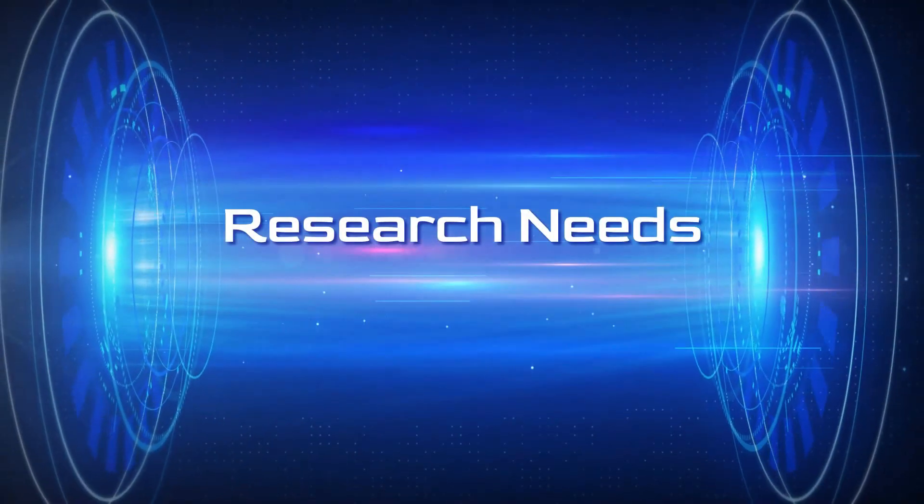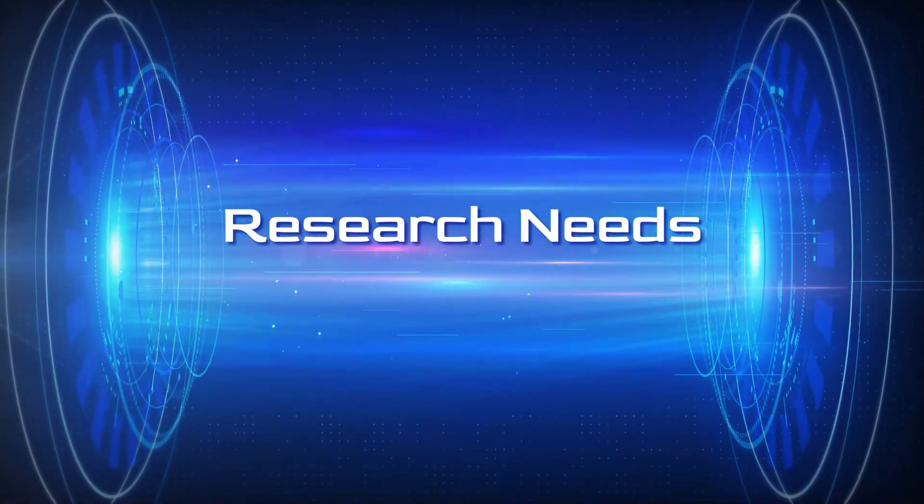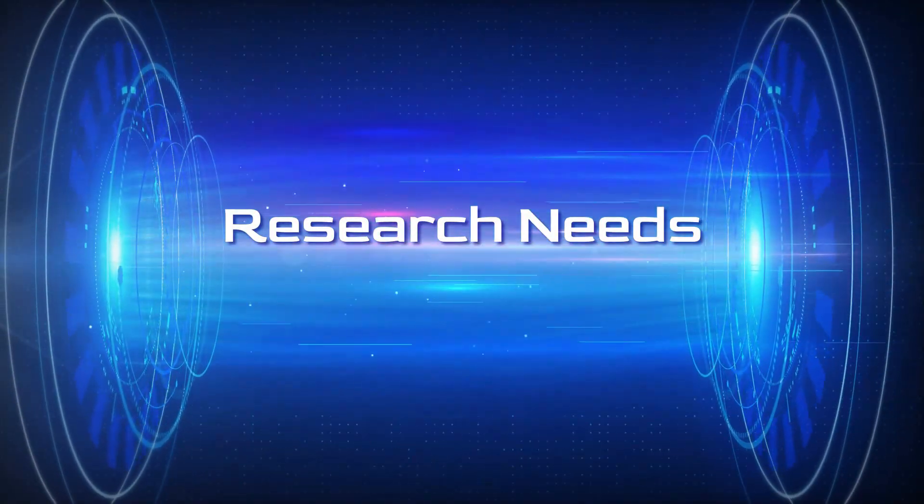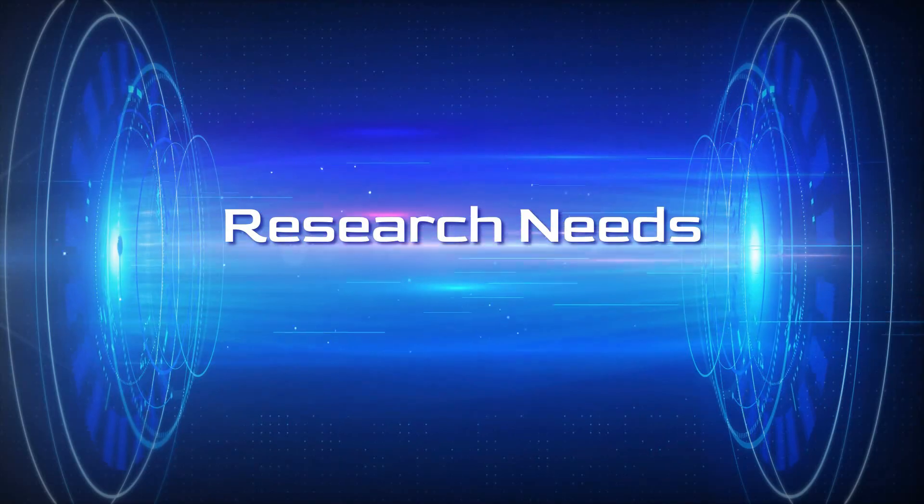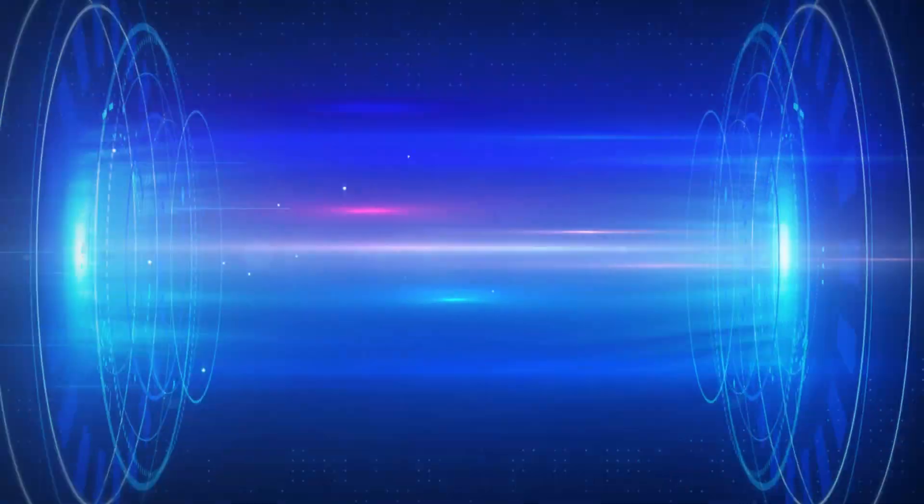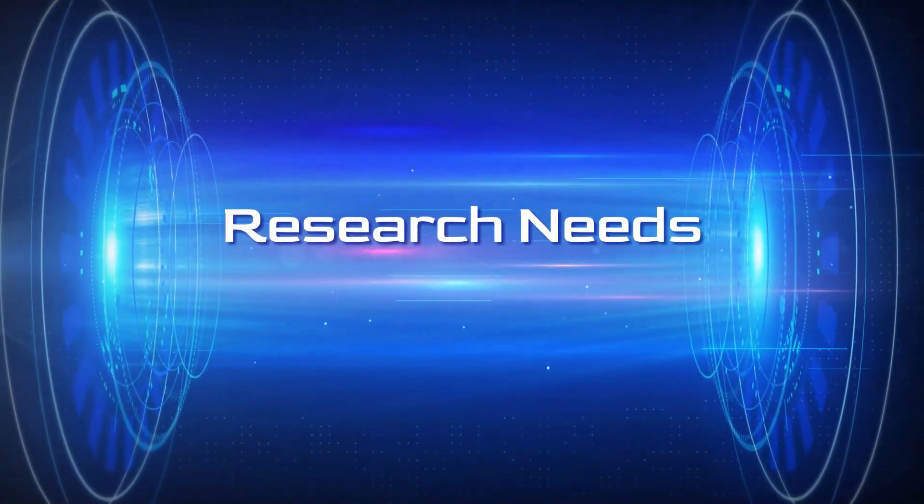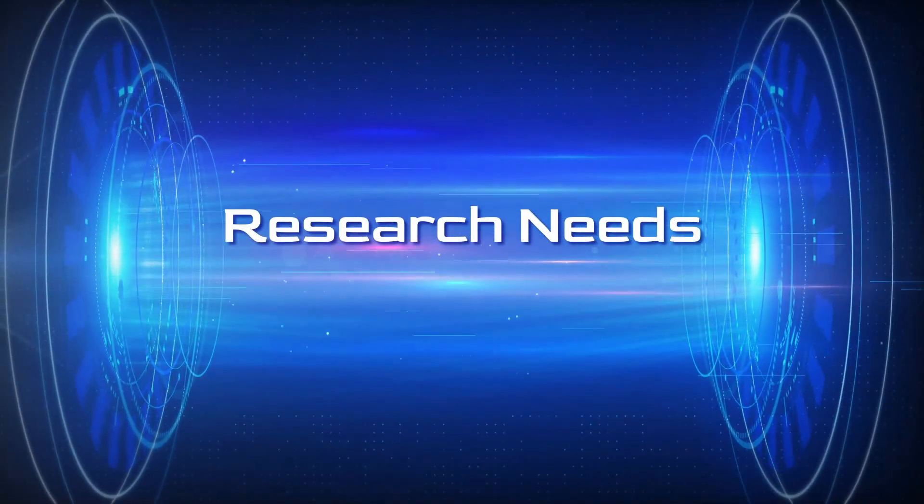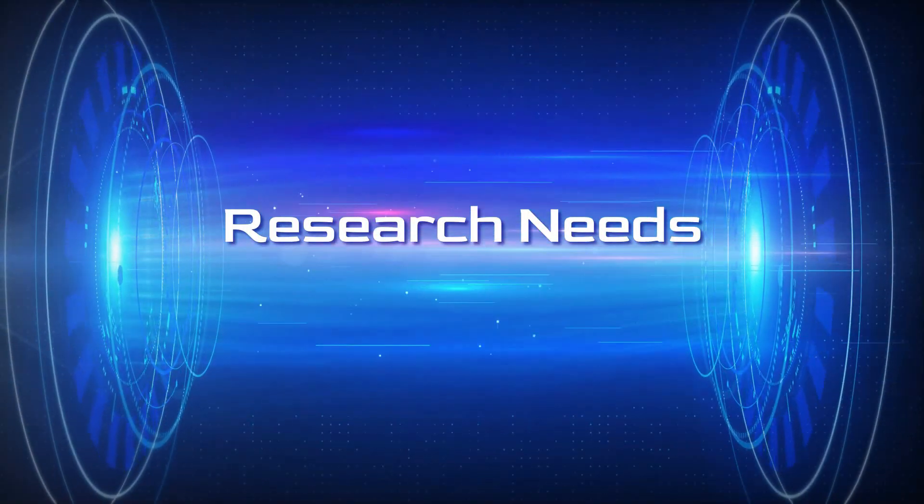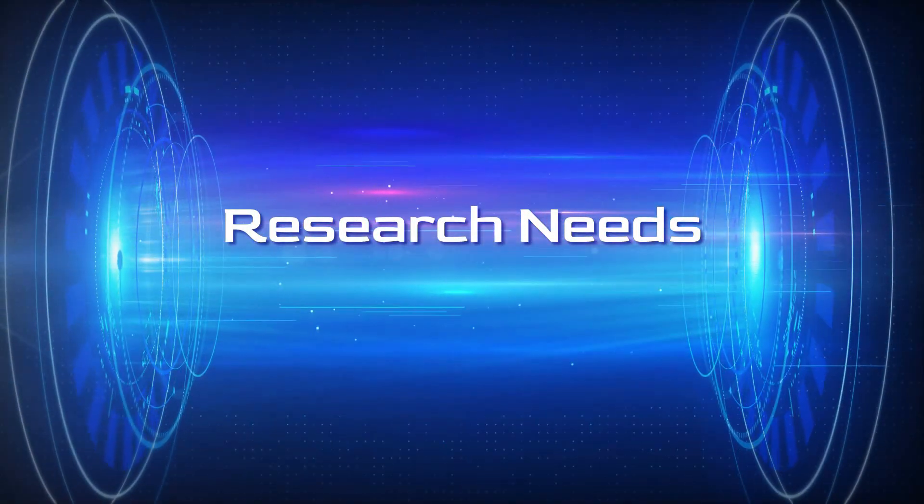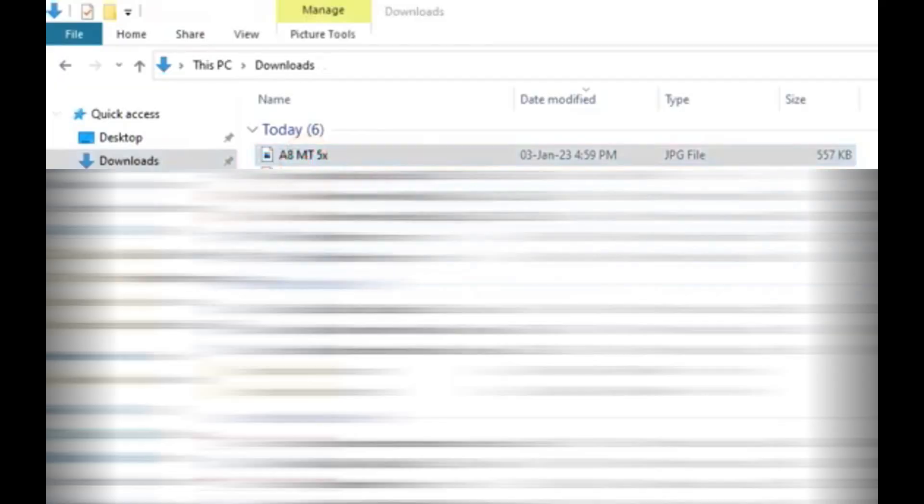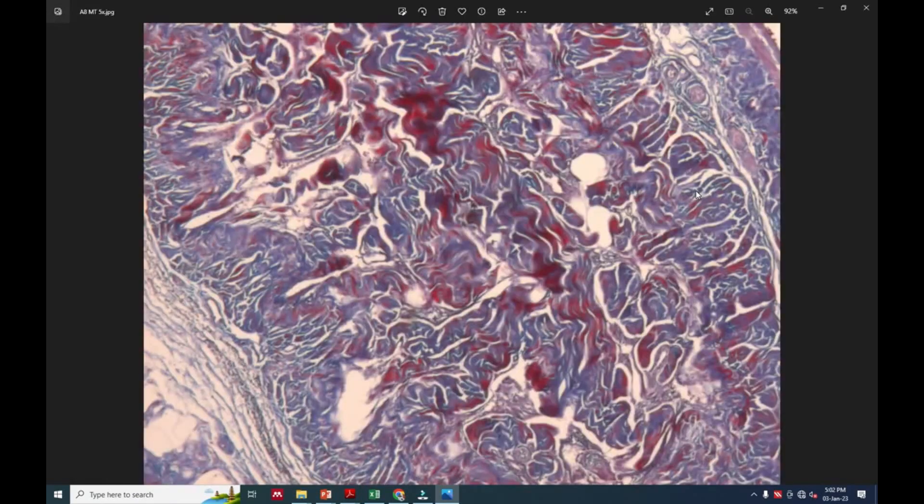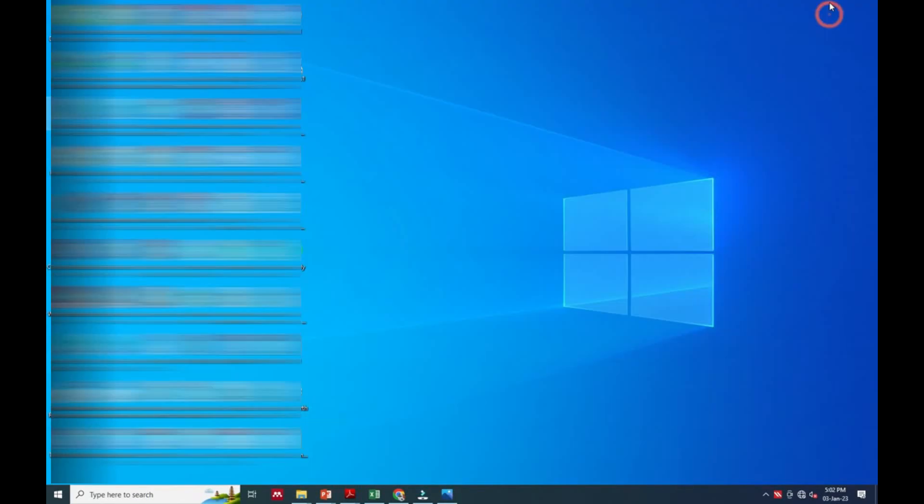Hello friends, welcome to Research New channel. Today we're going to see how to calculate or measure a stained area or colored area in an image by using ImageJ software. For that we have selected an image.